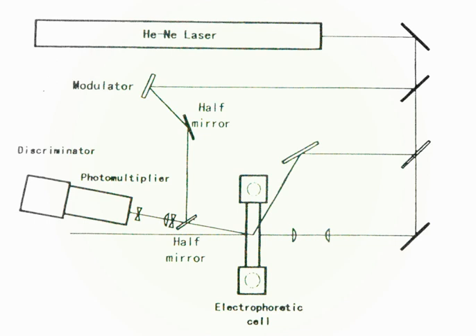The parabolic curve of frequency shift caused by electro-osmotic flow shown in Fig. 6 fits with EQ 11 with application of the least squares method. Since the mobility is proportional to a frequency shift of the light scattered by a particle and the migrating velocity of a particle as indicated by EQ 7, all the velocity, mobility, and frequency shifts are expressed by parabolic equations. Then the true electrophoretic mobility of a particle, and the electro-osmotic mobility at the upper and lower cell walls, were obtained.